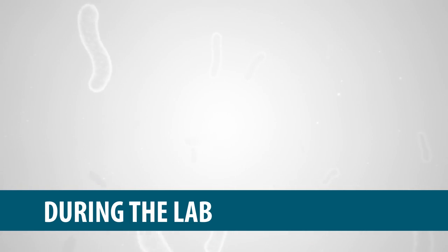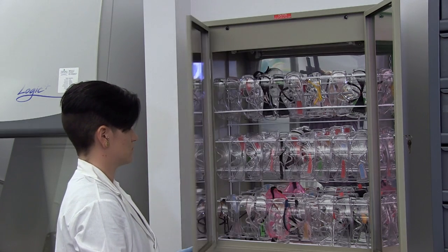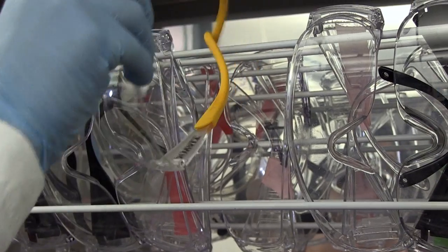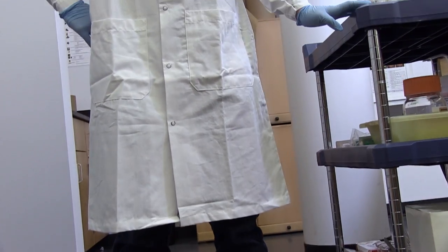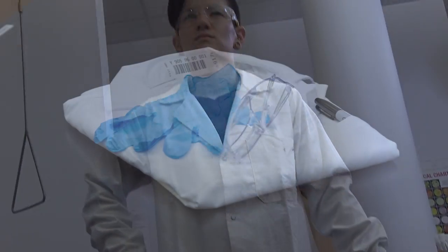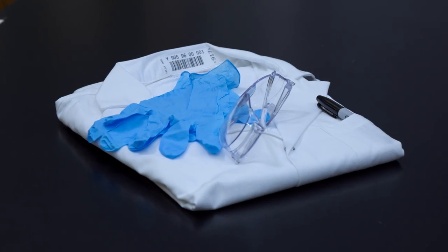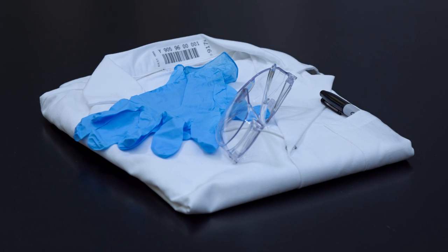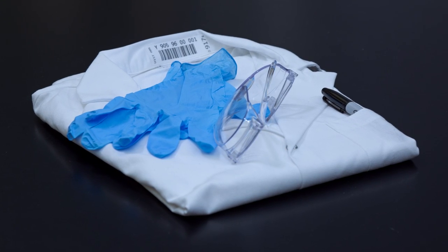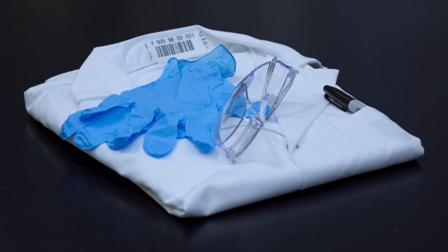During the Lab: Always wear a lab coat, gloves, and safety goggles while working in the lab. The lab coat should only be used during lab and should remain in the lab. Even discounting potential biohazards, a lab coat will protect your clothing. There is a reason many of the chemicals you will be working with are called stains.